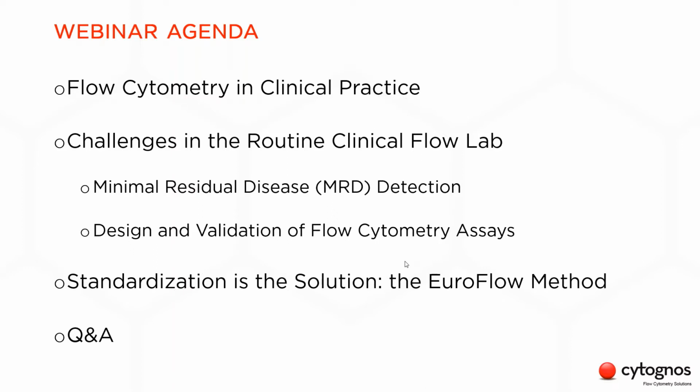Then I will talk about the current issues we face in the clinical routine lab, and I will focus on the specific challenges of the minimal residual disease assays and on the design and validation of flow cytometry tests. Finally, we will see how we can overcome these challenges with a fully standardized solution, the EuroFlow method. And at the end of the webinar, we'll have a few minutes for questions.